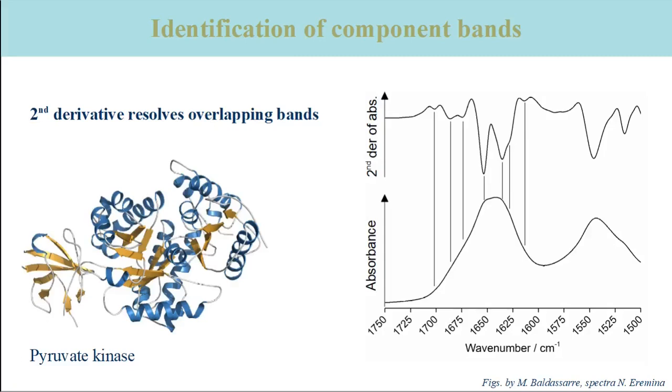used. The second derivative of a single absorption band has a minimum, where the absorption band has a maximum. The negative band of the second derivative is narrower than the corresponding absorption band. In a spectrum that consists of several component bands, the second derivative can therefore reveal the positions of the component bands better than the original absorbance spectrum. A disadvantage are positive side lobes in the second derivative spectrum that might be confused with real component bands in a complicated spectrum.